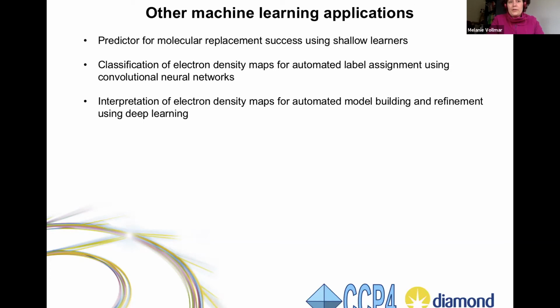Or the users try to do that at home themselves anyway, so they will never tell us what their PDB search model is. We also now try to do a classification of electron density maps simply for label assignment. The number of samples we have coming off the experimental phasing analysis is large enough that I personally can't assign the labels by hand, and using some cutoffs in terms of quality metrics we currently have is not reliable enough.